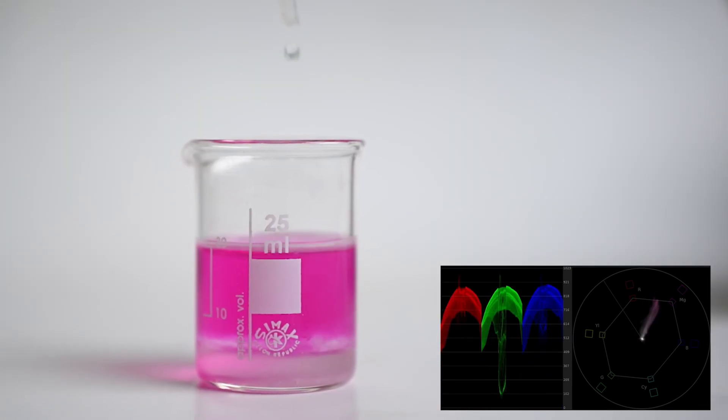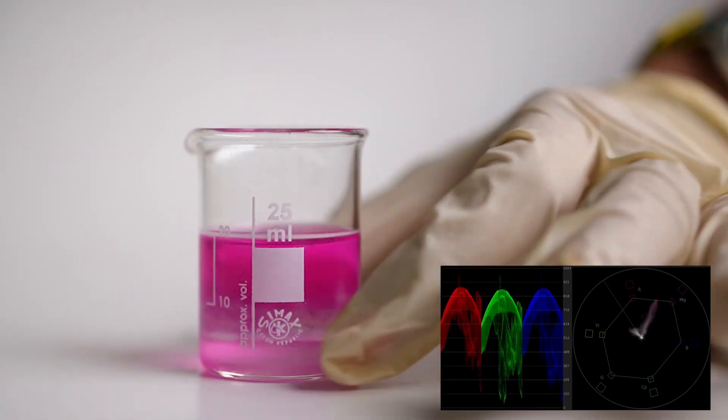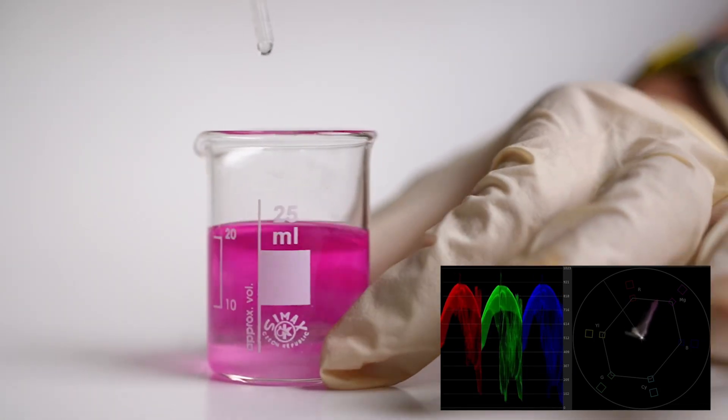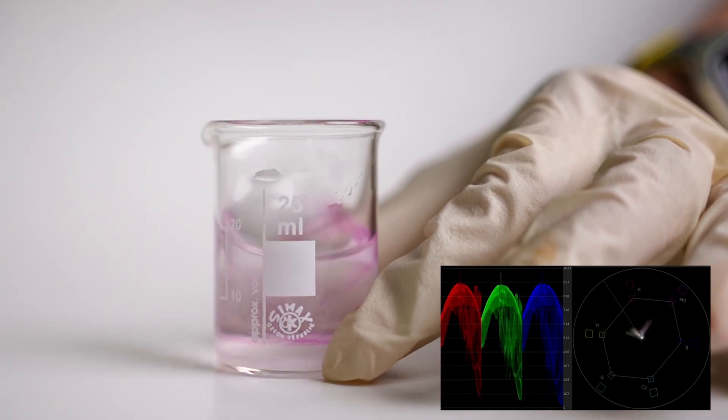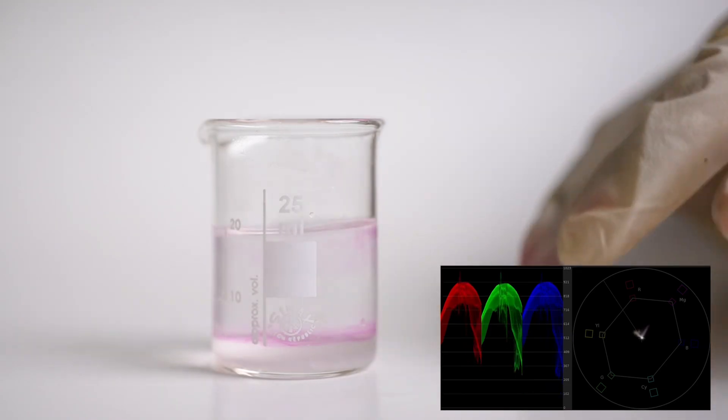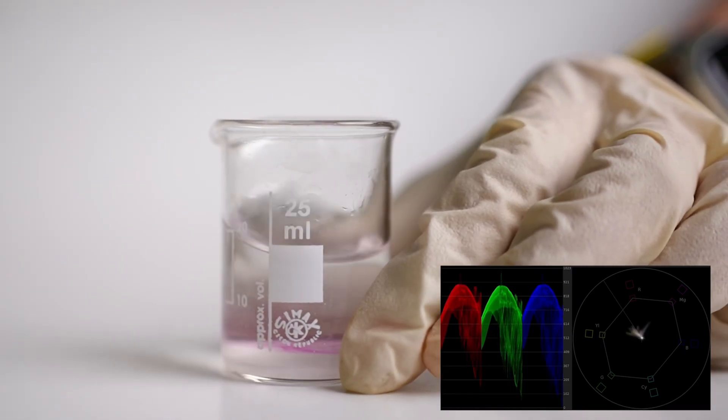Equivalence point is the stage in the titration when the amount of acid and base neutralize each other and we notice this phenomenon by the color change in the solution, and changing color takes only one drop. When you pass the equivalence point it means you have excess acid or base in your solution.